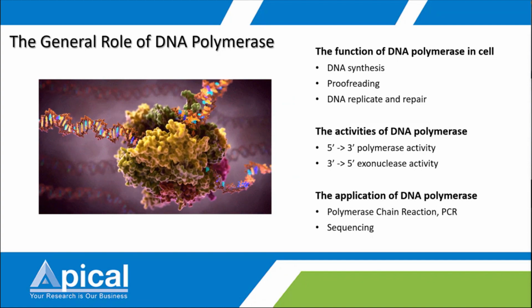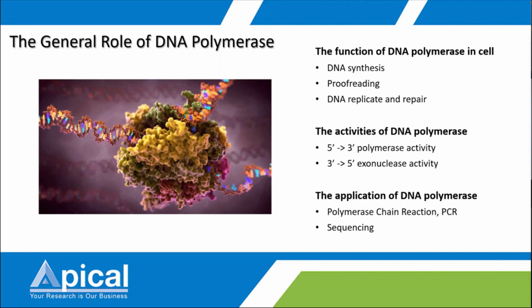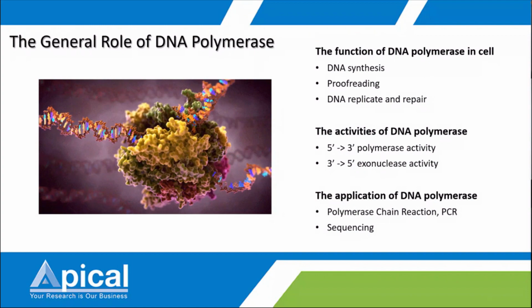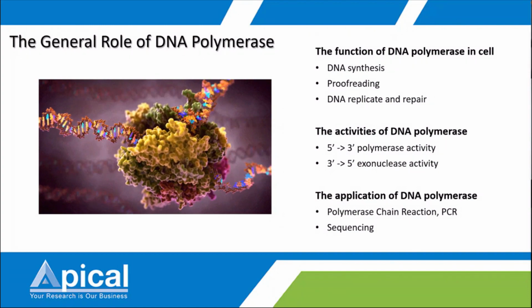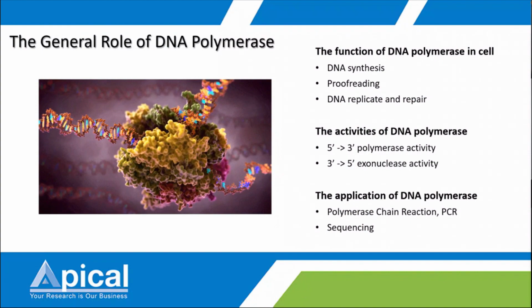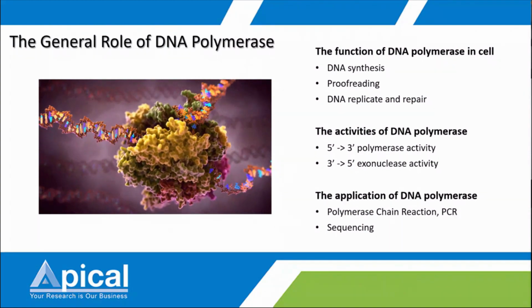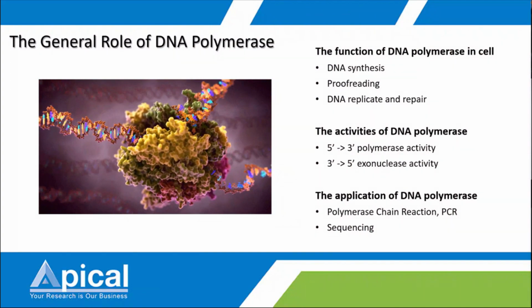The 5' to 3' polymerase activity helps in amplification, while the 3' to 5' exonuclease activity helps in making sure the sequence you determine in your PCR product is similar to the sequence from the template DNA.